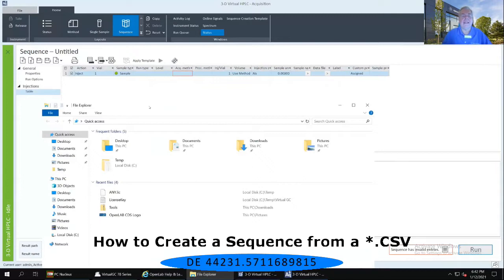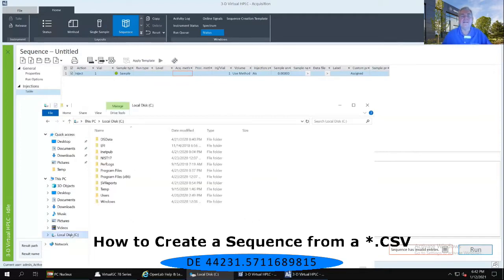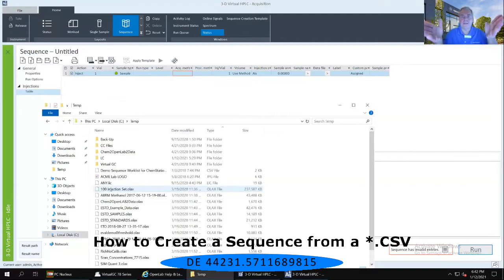Then select Local Disk C in that Windows File Explorer window, Local Disk C. Double-click on Temp on the right-hand window.